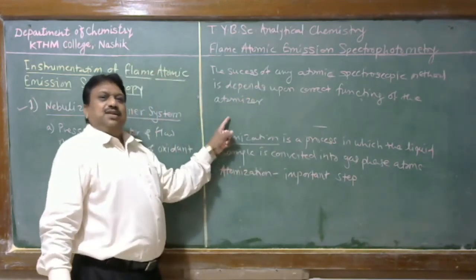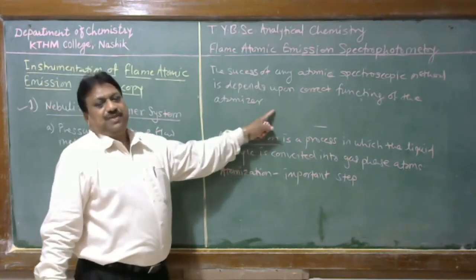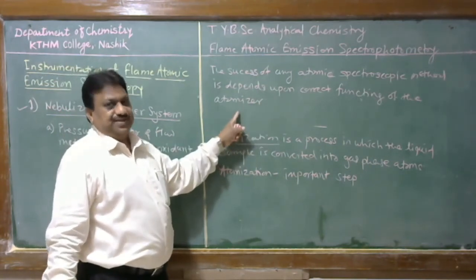If the atomizer gives a reproducible flame, then we have a reproducible result.